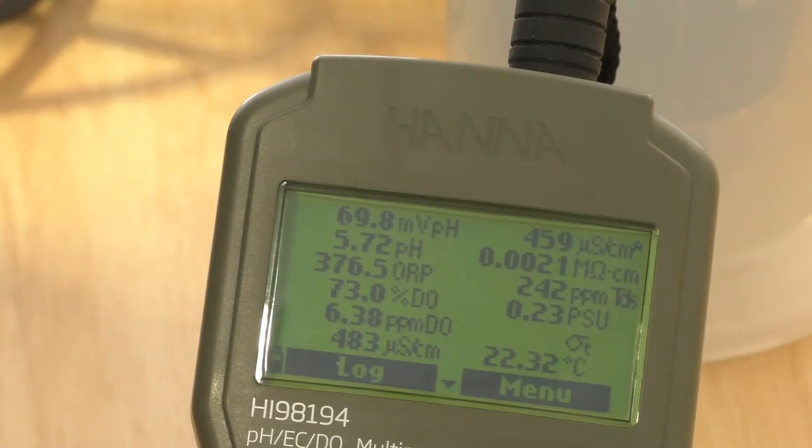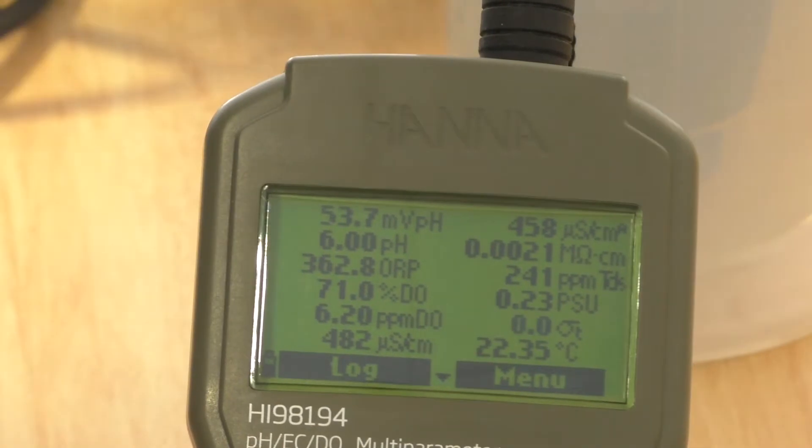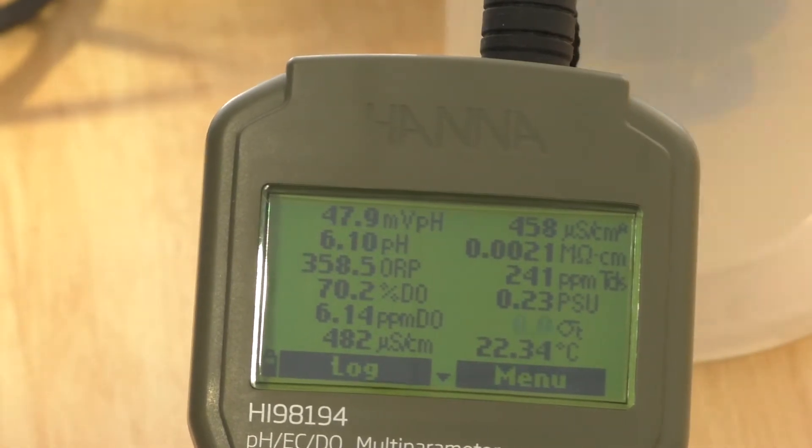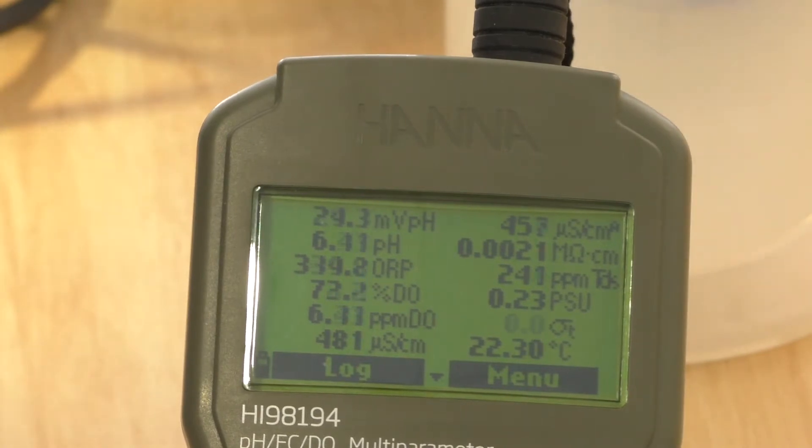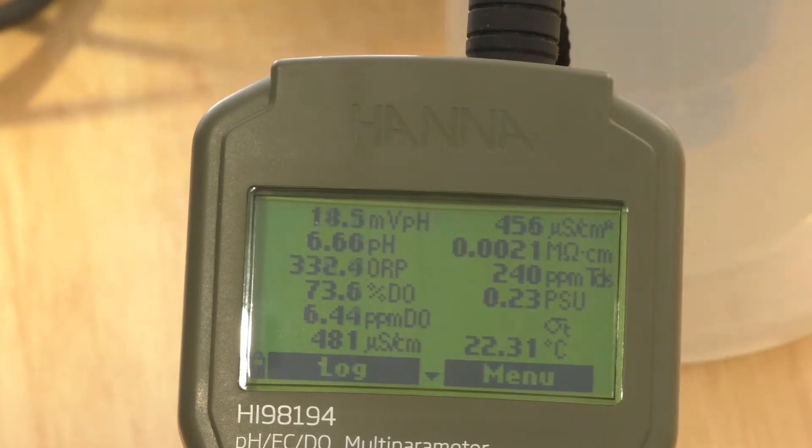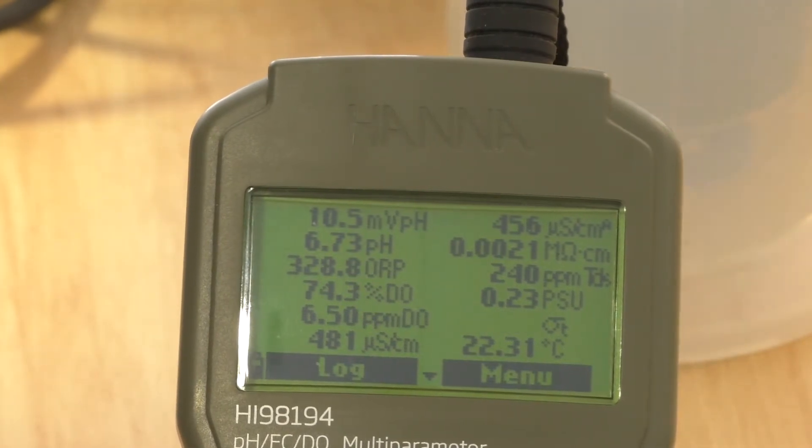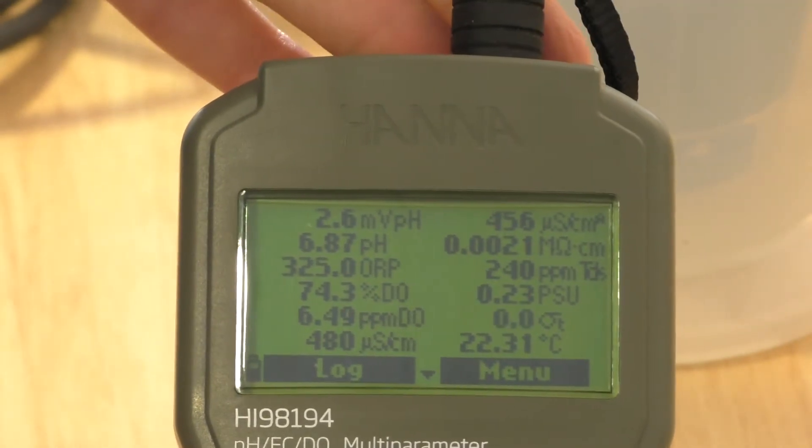So we're just testing it in some tap water and you'll see the parameters all come back up. Just as with all water quality meters, you need a bit of movement of the water past the sensors for the quickest response. And this is sort of roughly what we'd expect from tap water.